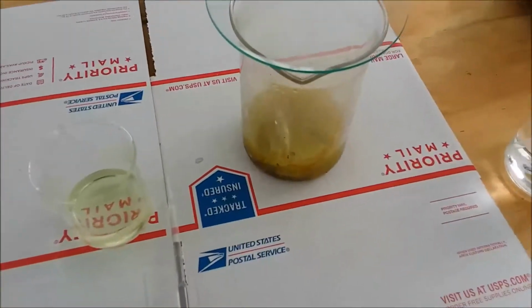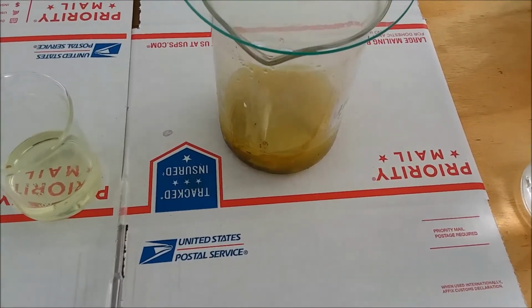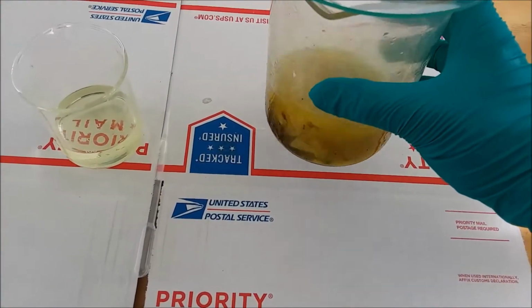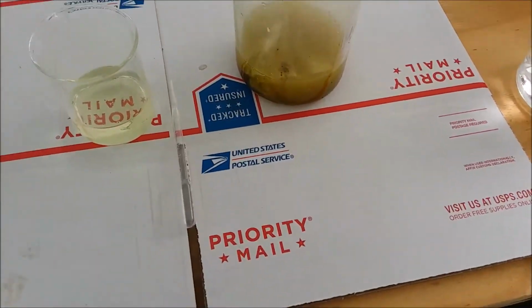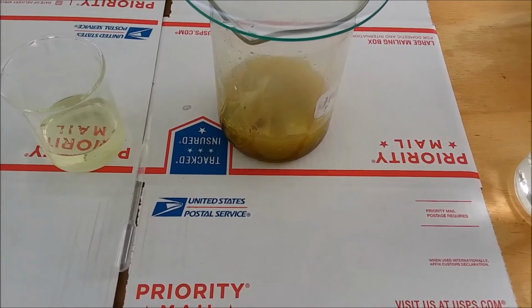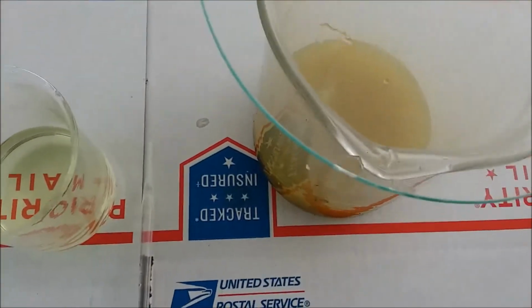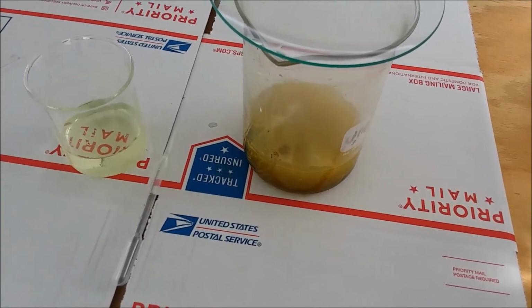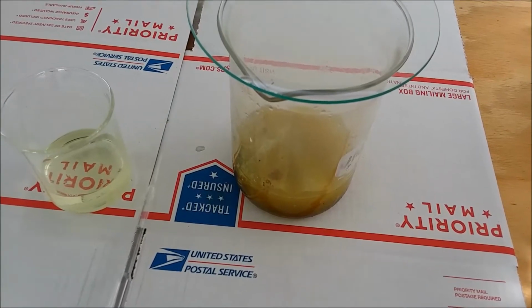It does look like the gold is dissolving. It's going slowly, but like I said before, I'm not in any big hurry. I suppose if I put this on the heat, it would go quicker. But that would also drive off the chlorine gas that's being produced. So I don't know, that might be counterproductive. I think I'll just leave it like this for now, and let it sit for a while longer and we'll see what happens.